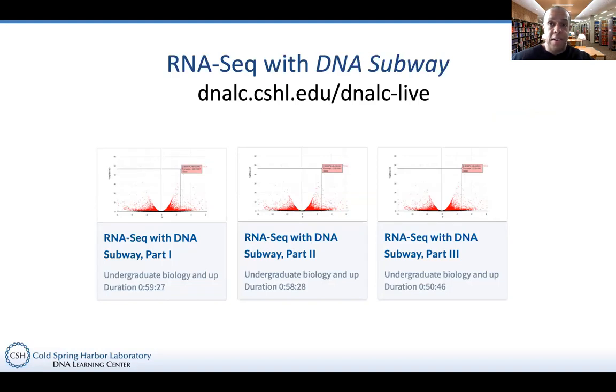That platform is actually much easier to use in some ways than a Jupyter Notebook. But if you want to go into some of the details, I'm not going to cover necessarily to that level of depth in this series. Be sure and watch those. It's quite a bit of watching, but I hope you'll find it enjoyable and informative.